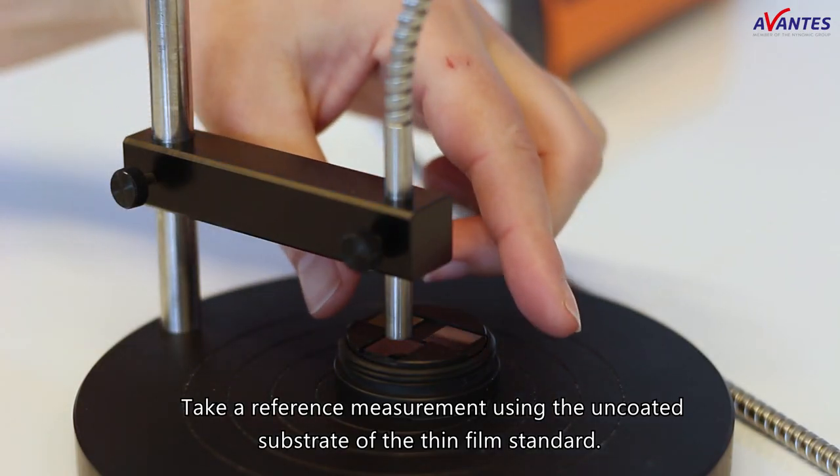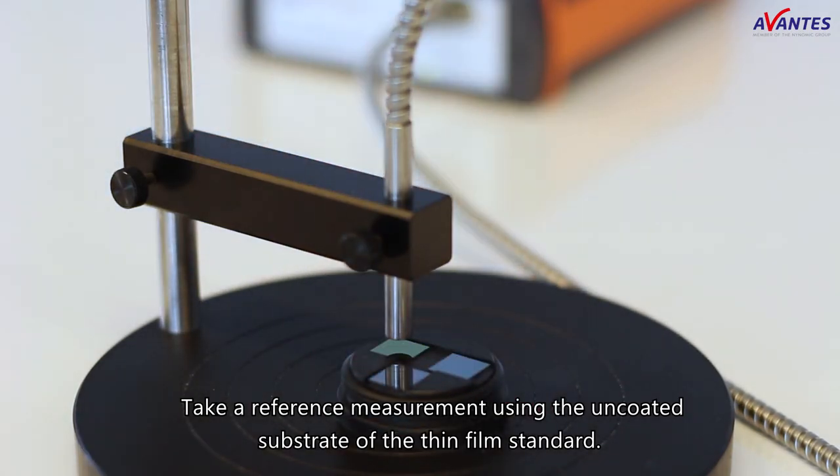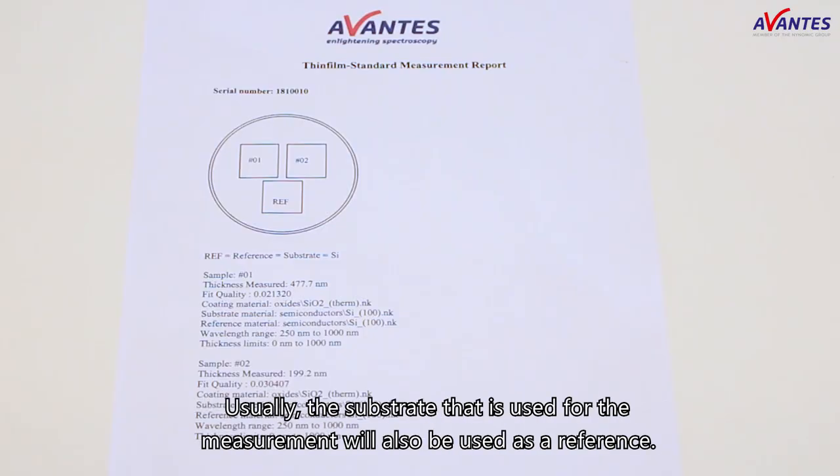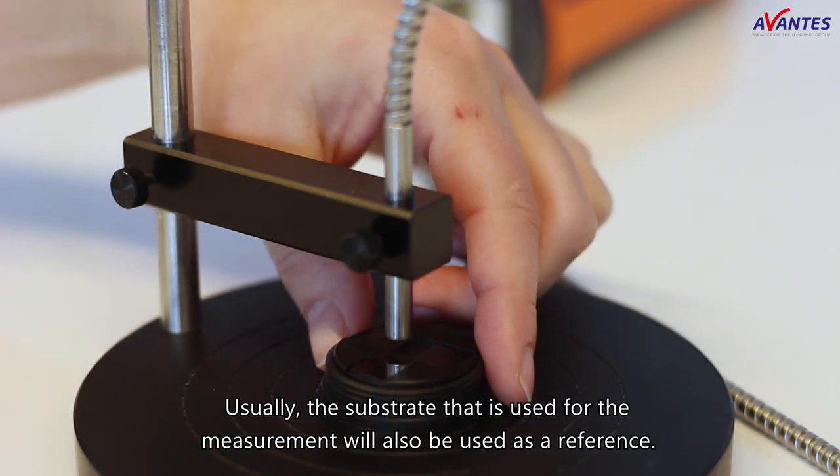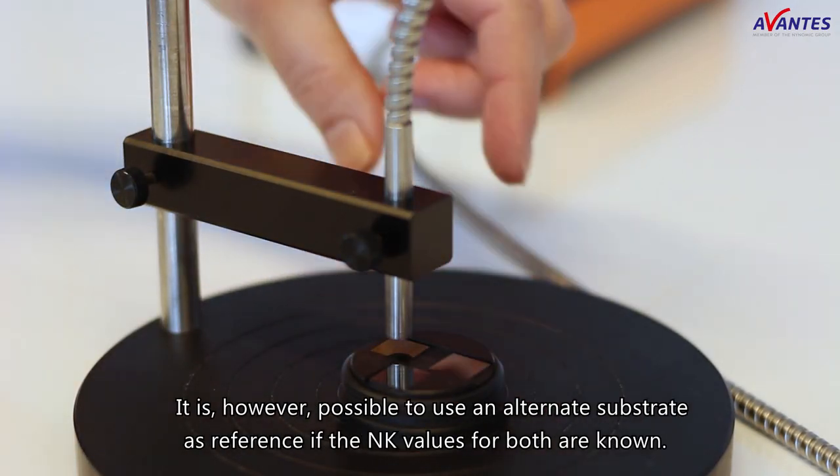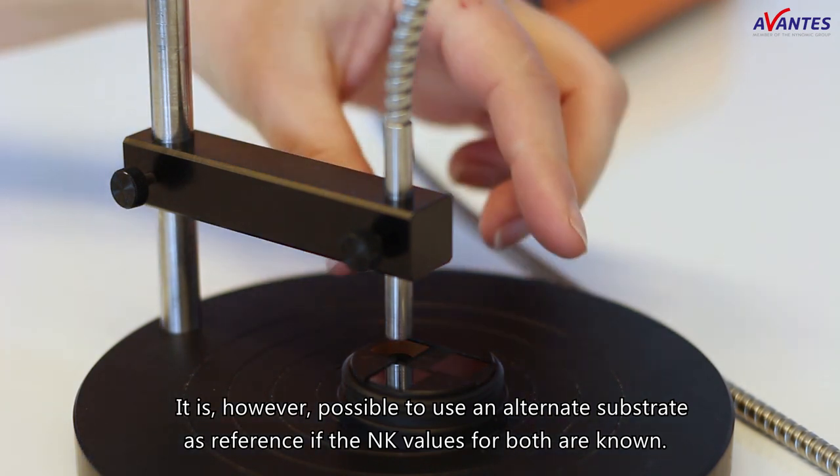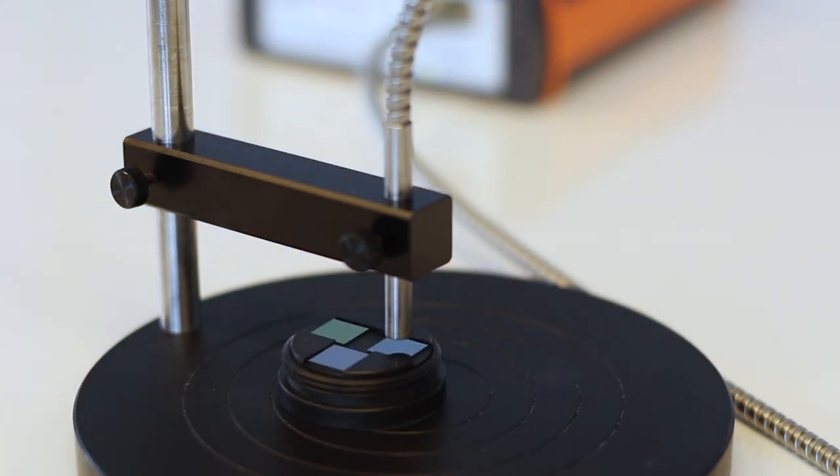Take a reference measurement using the uncoated substrate of the thin film standard. You can find the information regarding the surfaces of the thin film standard in the box. Usually, the substrate that is used for the measurement will also be used as a reference. It is, however, possible to use an alternate substrate as a reference if the NK values for both are known.